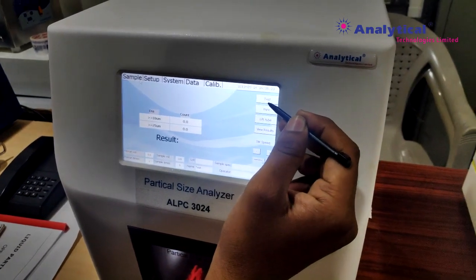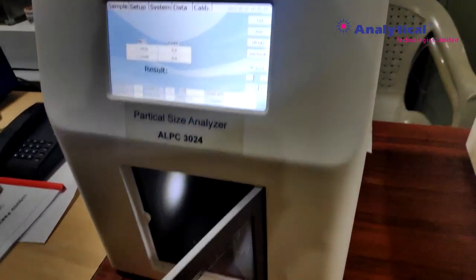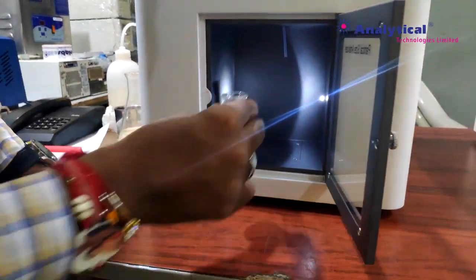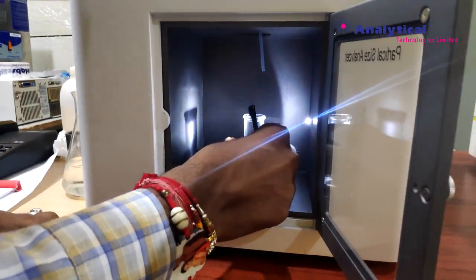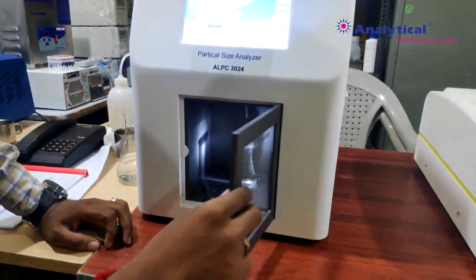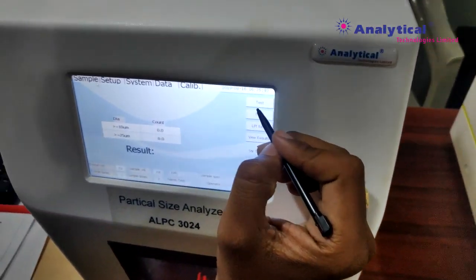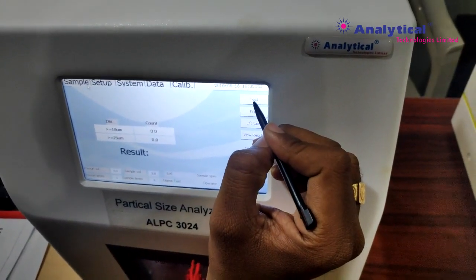This is the test point. We can directly test with a particular sample like this. Place it here, close it, then we can directly test by this point.